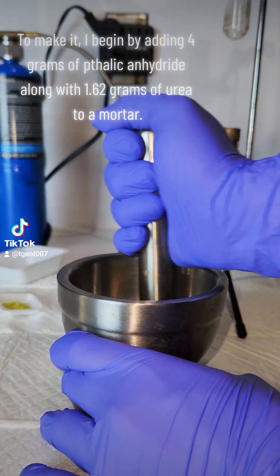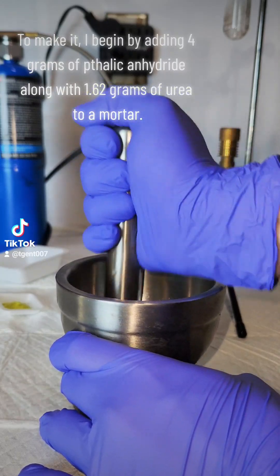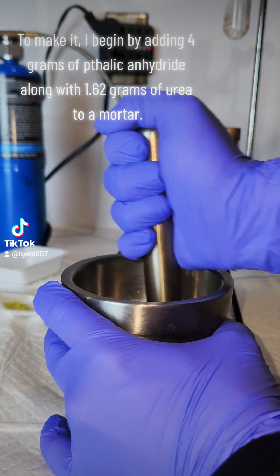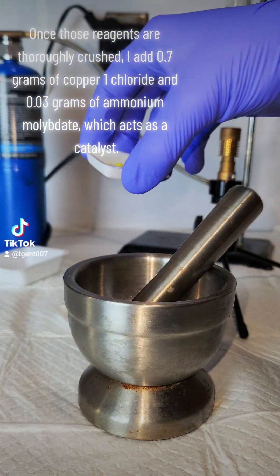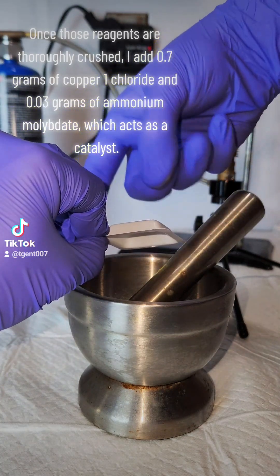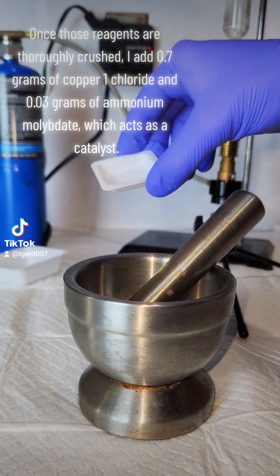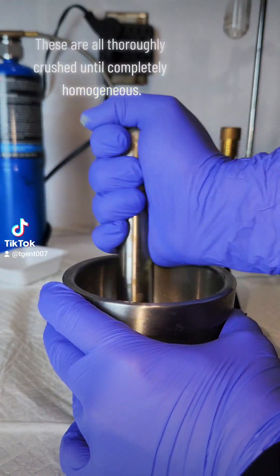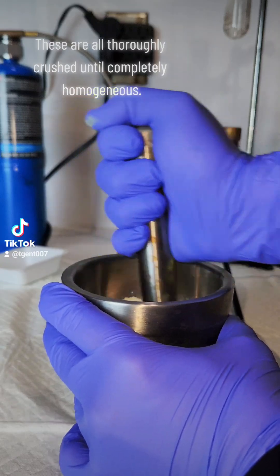To make it, I begin by adding 4 grams of phthalic anhydride along with 1.6 grams of urea to a mortar. Once those reagents are thoroughly crushed, I add 0.7 grams of copper 1 chloride and 0.03 grams of ammonium molybdate, which acts as a catalyst. These are all thoroughly crushed until completely homogeneous.